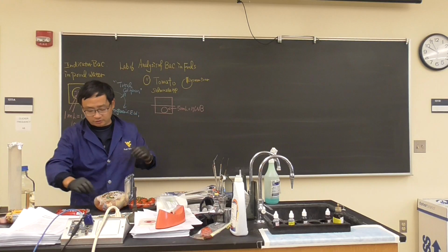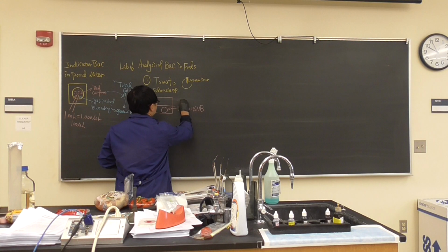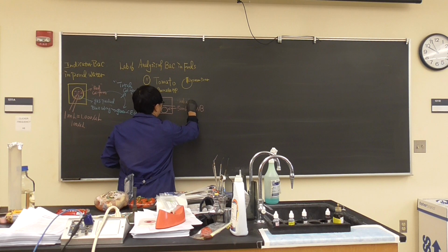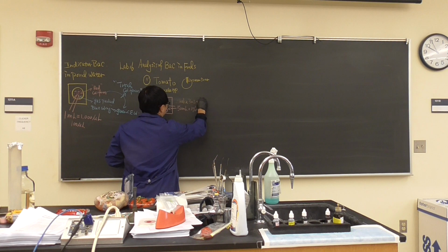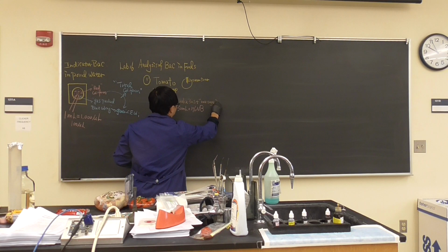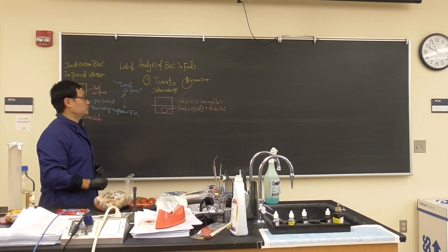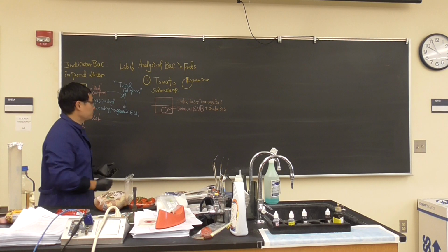I prepared this sample for some of you. You can go ahead and use it. So this is what we will do: shake 30 seconds, massage 30 seconds, and shake 30 seconds. So that is a tomato. That's how we prepare.